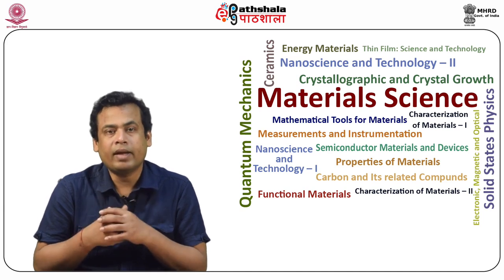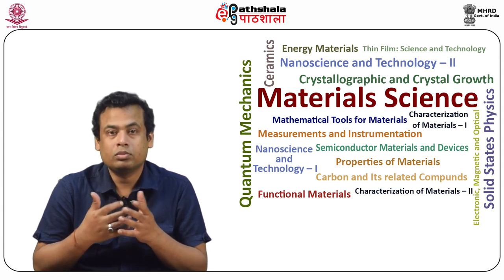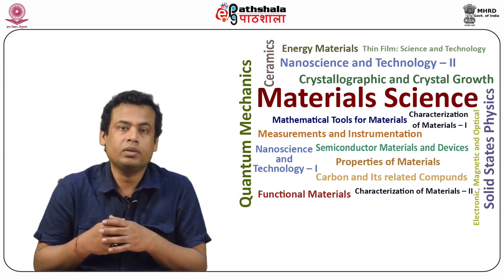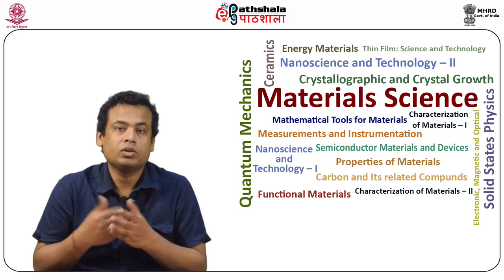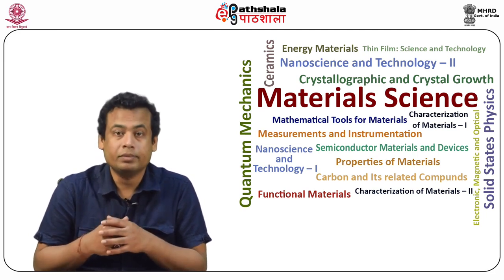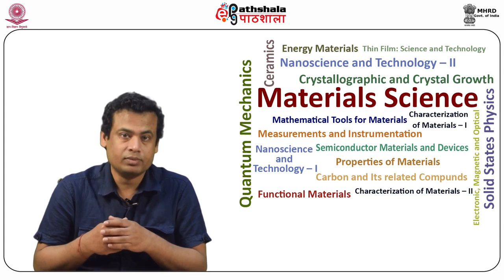So, how does the electron microscope work? The waves in an electron beam can be coherent, that is, waves of the same wavelength, or incoherent, with waves of different wavelengths.